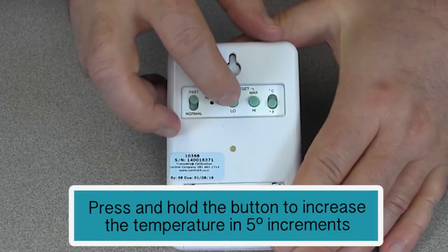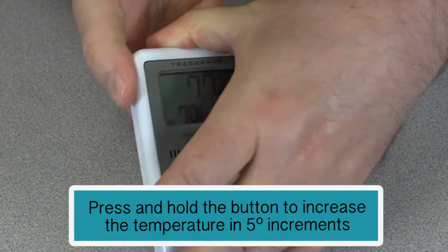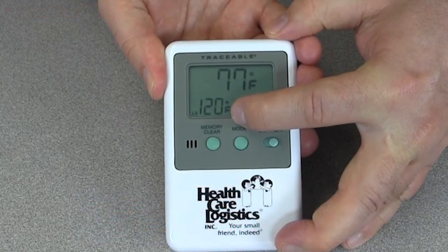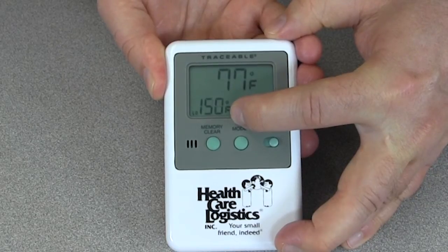Now if I were to take my finger and hold the low button and turn the device back over, you will see that the temperature is being increased by increments of five degrees. After reaching 155 degrees Fahrenheit the temperature will then reset back to negative 55 degrees Fahrenheit.